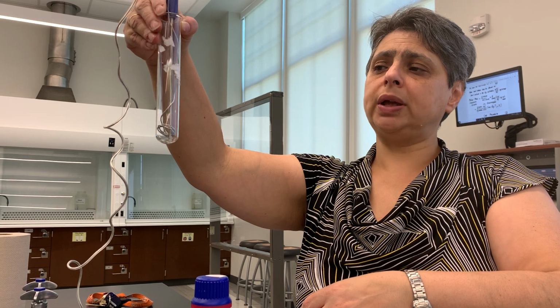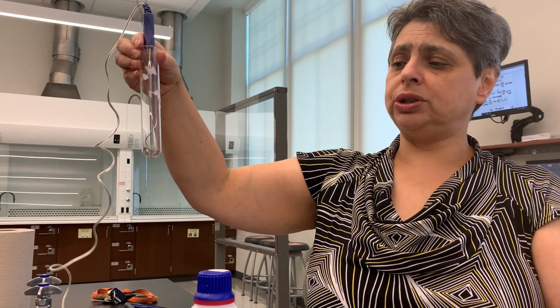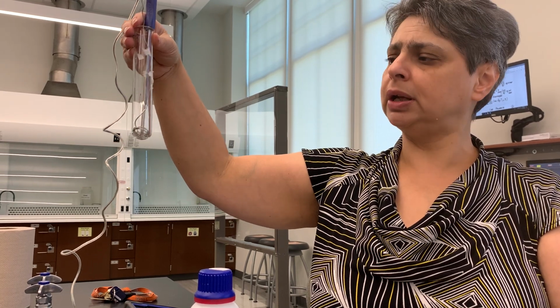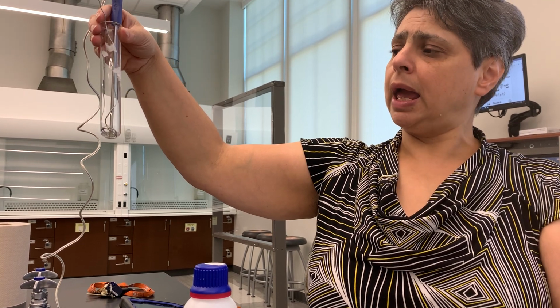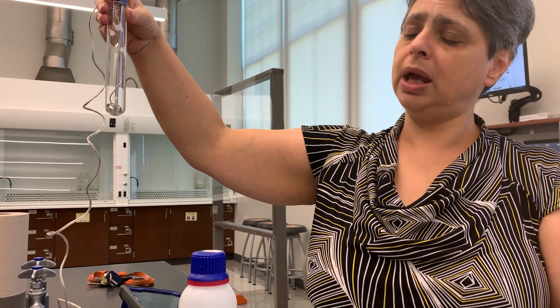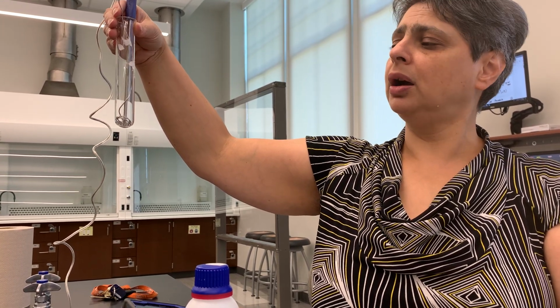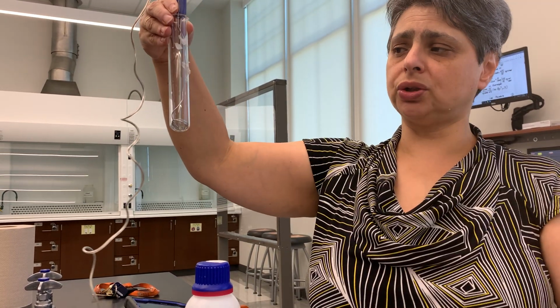And then you'd be able to print that cooling curve, and we're going to discuss what this cooling curve would look like in a minute. Then, after you did this a couple of times to get 2 trials in for your pure solvent, you would be assigned a solute, which could be either a liquid or a solid. You would either weigh a certain amount of solid, close to 2 grams if it's a solid unknown. If it was a liquid unknown, you would get help from TAs measuring exactly either 1 or 2 milliliters of a specific unknown into here to create a solution.